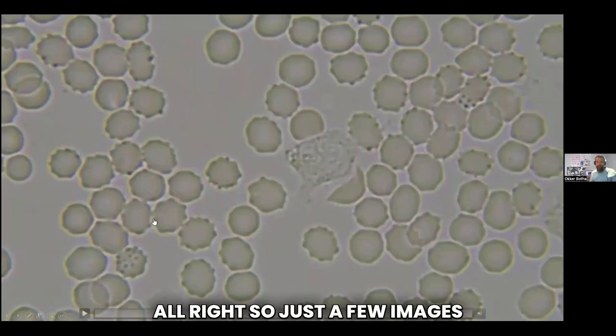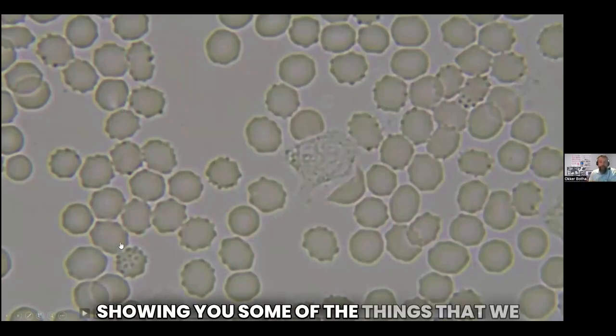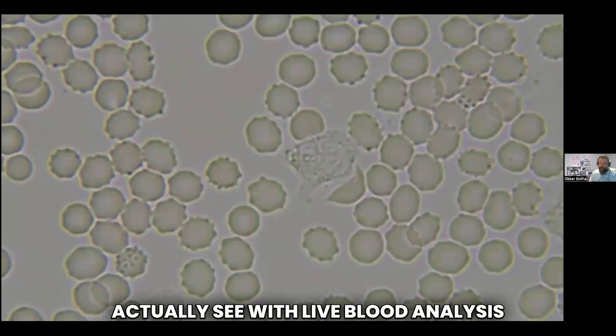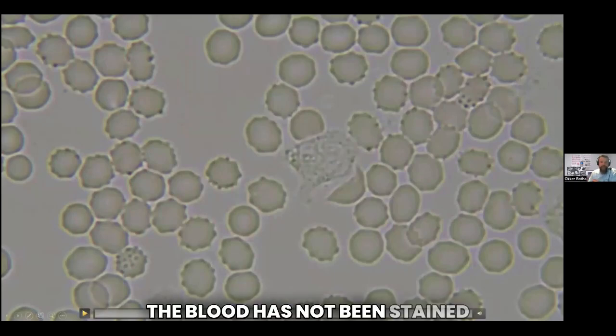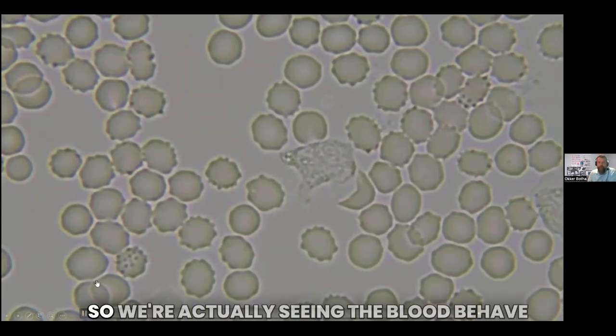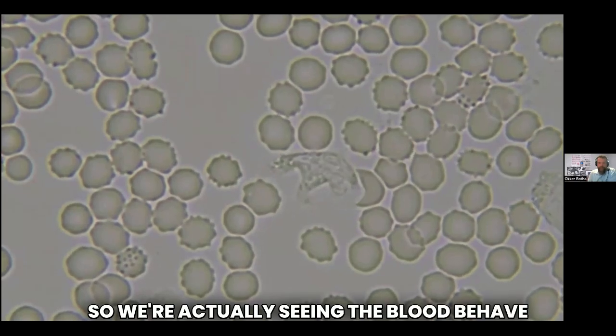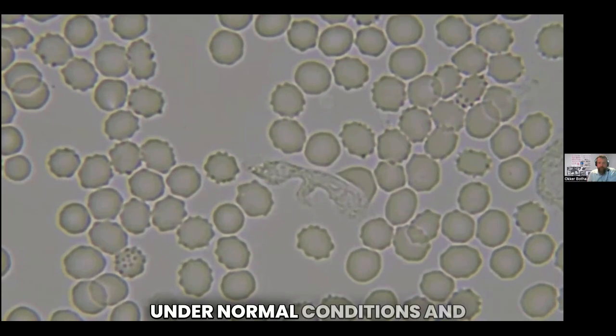All right, so just a few images. I've got a video here as well, just showing you some of the things that we actually see with live blood analysis. And one of the greatest benefits is that it is an actual live sample. The blood has not been stained or altered in any way. So we're actually seeing the blood behave, the cells behave like they do in the body under normal conditions.